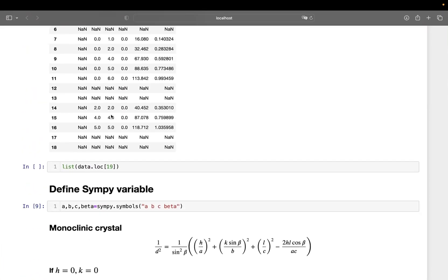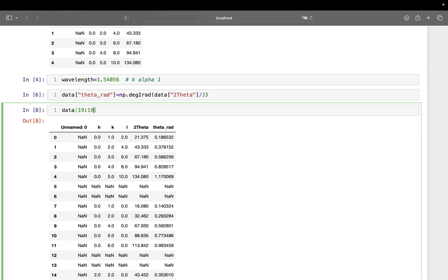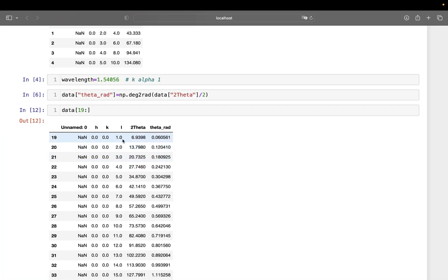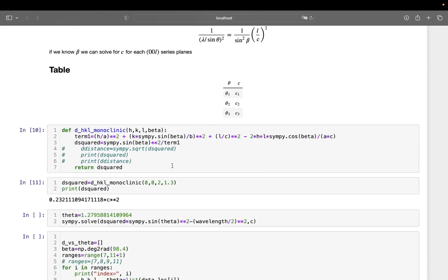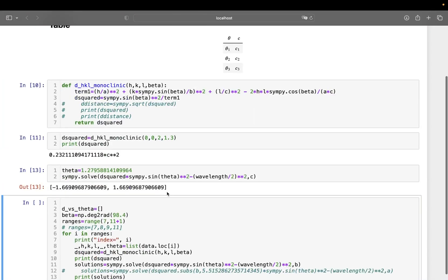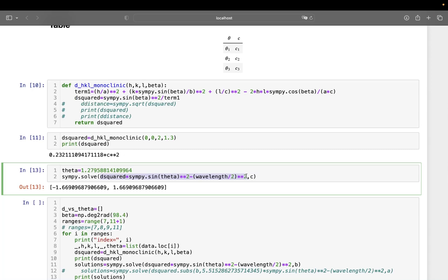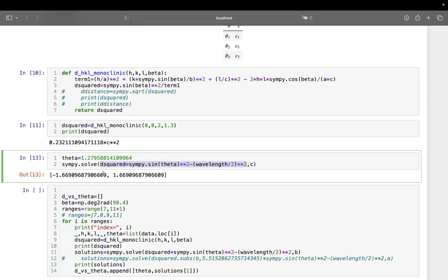I can do this for all planes where h and k are both zero. The symbolic Python solve works by setting up an expression equal to zero — like ax² + bx + c = 0 — and solving for the unknown. We get two solutions (positive and negative) because it's a quadratic; since c must be positive as it's a length, we take the positive value.